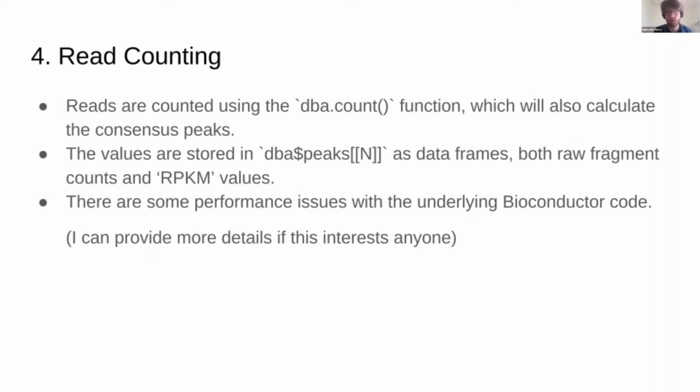And it will also calculate the RPKM or FPKM values. For those of you who don't know, that's reads per kilobase per million reads, I think. I'm probably wrong. Someone correct me if I'm wrong. And you will sometimes see FPKM instead, which is fragments, which is just from when you're doing paired end sequencing. You count a fragment rather than a single read, because a fragment is 2 reads. It's a bit pedantic, really, but you will see that. You saw that in the paper figure. They do FPKM, and it'll be the case with this tutorial as well, because we know they're double-ended.